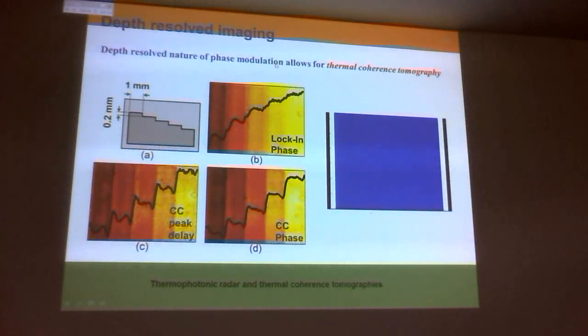Unfortunately, I don't think that this image works. I tried it many times, but I was going to show, oh, wow, what do you know? So here goes. Surprise. So each and every location, now it shows very clearly that location as you're moving deep into the sample without the washout effect of diffusion, because again, you're having a much narrower autocorrelation. That's what it comes down to when you saw that cross-correlation function. The autocorrelation also of the thermal field is not much better. So anyway, let me show it once again, because at the time we were very much impressed by the localization of the heat at different depths, all the way down to the deepest point.